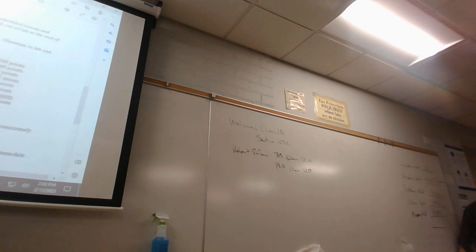One of the first lab experiments we're going to do is titration. And this is the acid we're going to use in day one of our titration. It's oxalic acid. What is the formula for oxalic acid? HC2H4. Close. Half of it's correct. Well, less than half. 1/4 of that's correct.